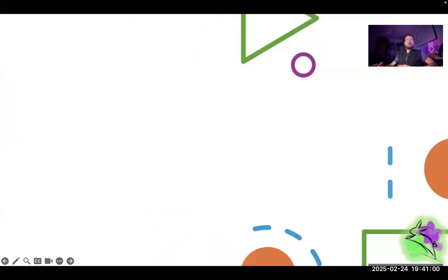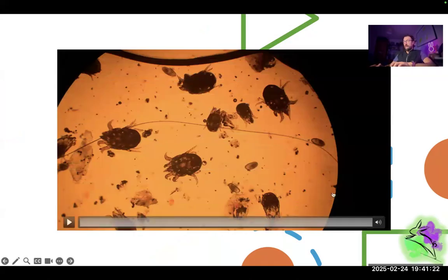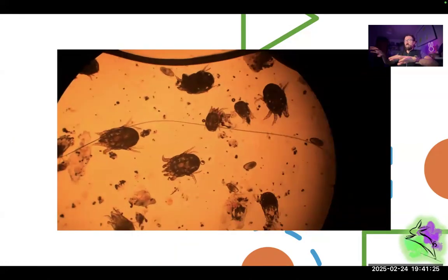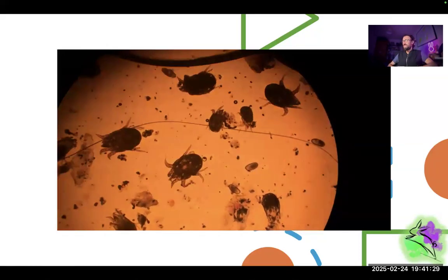And once the vet has put the sample on a slide and turned on the microscope, the journey begins. So we can start to assess our sample. And this is what you could find in front of your eyes if you look at the microscope. A party directly under the magnifying glass of the microscope. And as you can see, everything starts to move. I know that now everyone starts to scratch, it's a normal reaction, perfectly understandable, but this is literally what we can see.